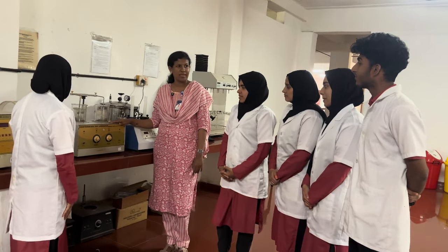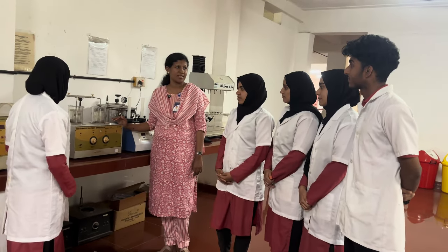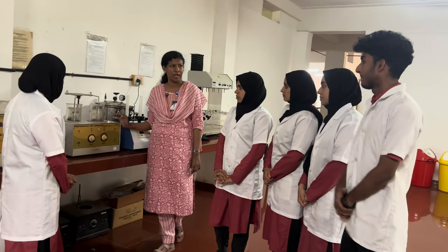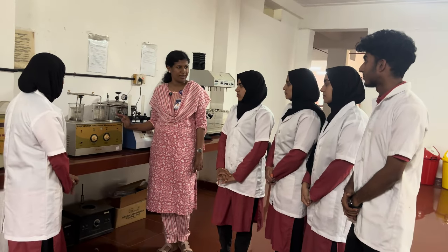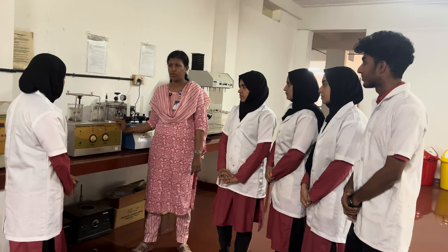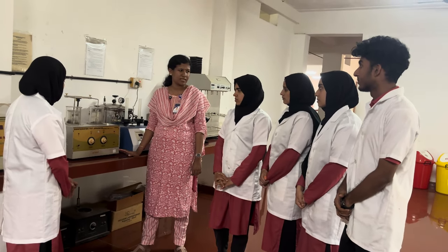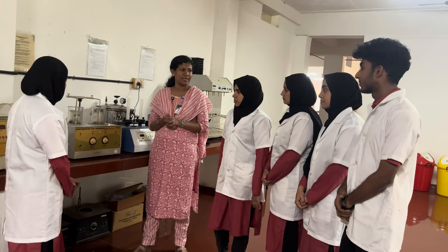So today our experiment is the disintegration test for tablets. On the evaluation of paracetamol, we are doing different evaluation tests. One of the tests for the evaluation of paracetamol is the disintegration test. What do you mean by disintegration?